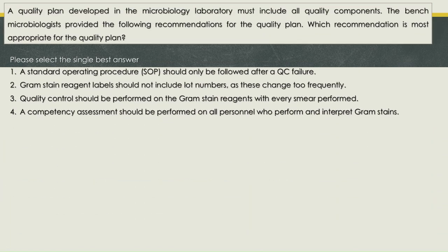A quality plan developed in the microbiology laboratory must include all quality components. The bench microbiologists provided the following recommendations for the quality plan. Which recommendation is most appropriate for the quality plan? Please select the single best answer.